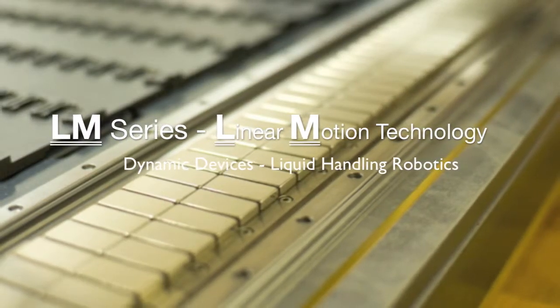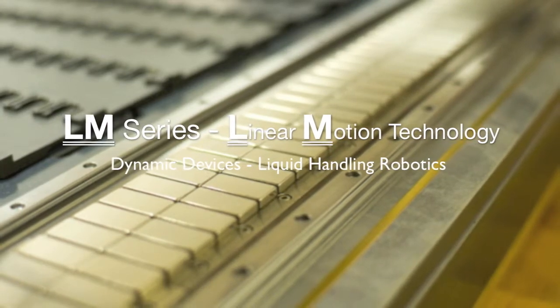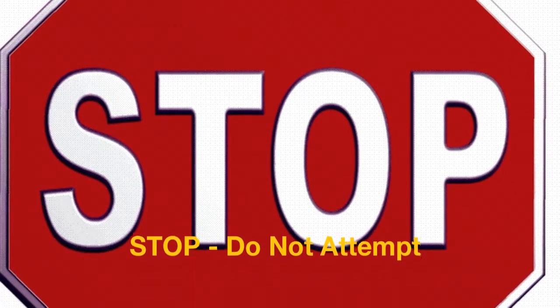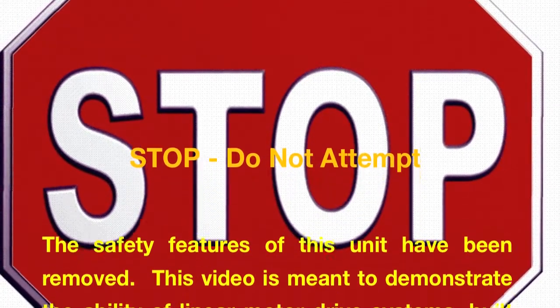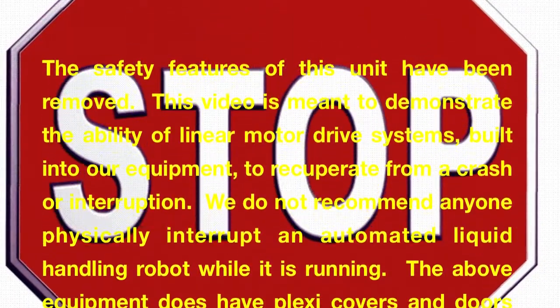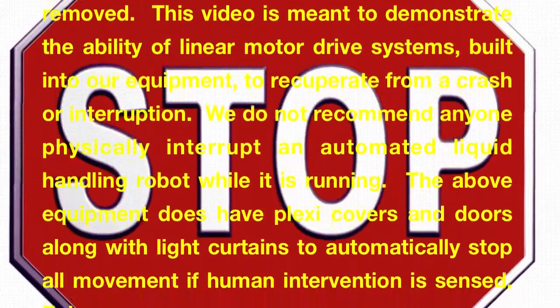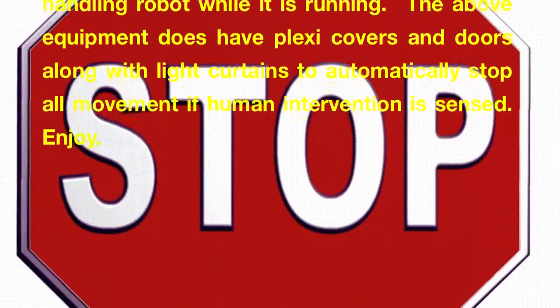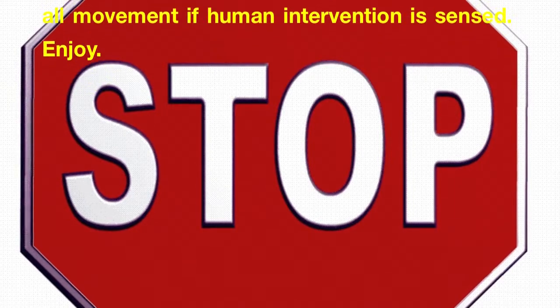Let's take a look at Dynamic Devices LM Series Liquid Handling Robot with Linear Motion Technology. In this demonstration, we have removed the covers to make it easier to access the arm. This is only for demonstration purposes — we do not recommend anyone actually interfere with a working robot. Safety shields and invisible curtains are recommended for use with all robotic workstations.